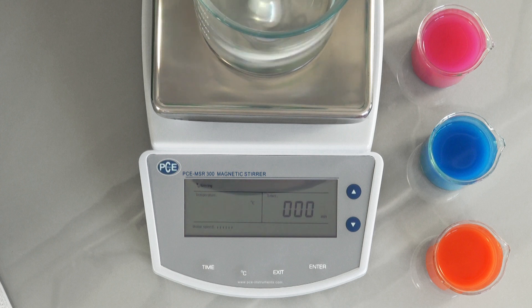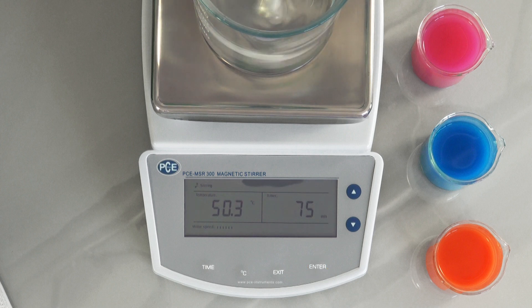With the help of the arrow keys you can set the minutes. By pressing the key longer it is possible to set the minutes in 10-minute steps. If you want to keep this setting, press the enter key. When the time has run down, the Magnet Stirrer stops automatically.